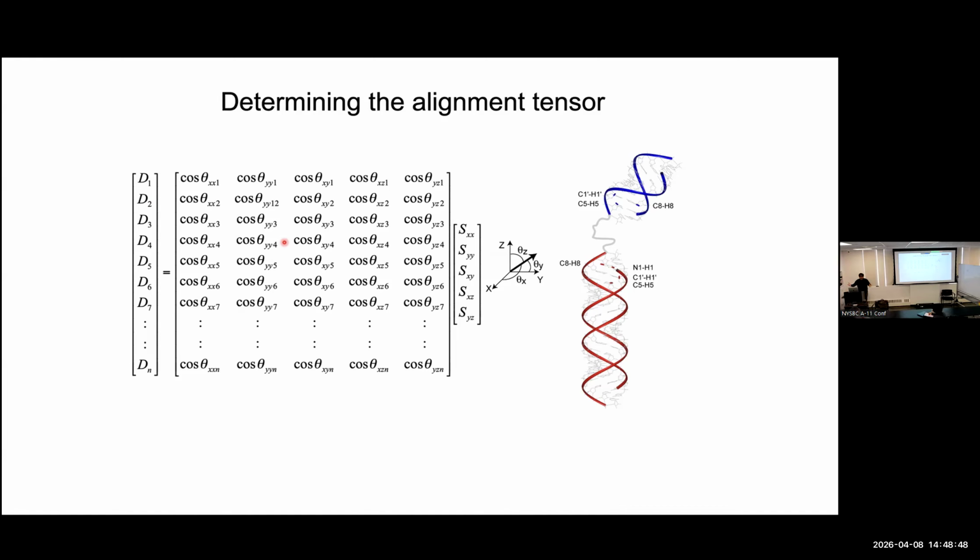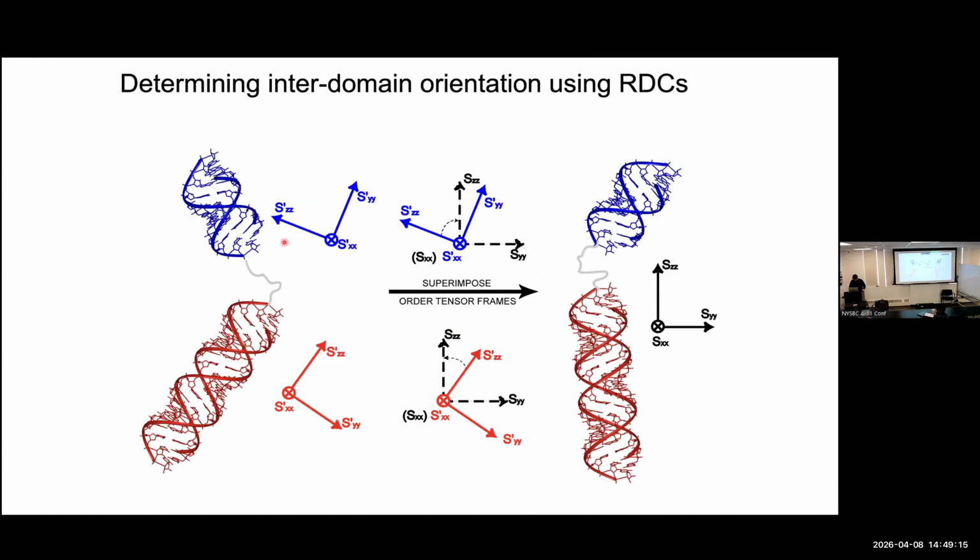The global alignment motions, which we generally don't care about, the alignment tensor, are captured by S. So anything related to the overall alignment and all that busy stuff, S is absorbing. But within the molecular frame, you could have internal motions, which will further average the dipolar couplings. So you have nested averages: the global average and the internal average. This is the way of separating each.